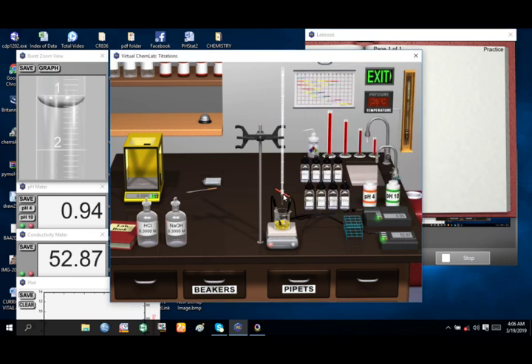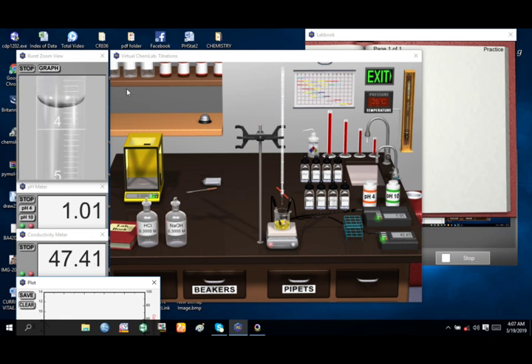You want to make it a little bit faster. And you can start recording the readings by just clicking save. Then you click again on the graph, save. It will record stop. The titration will keep on going till we record the color change in the solution.